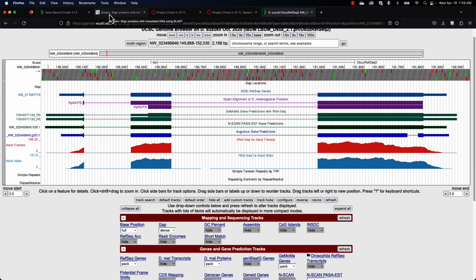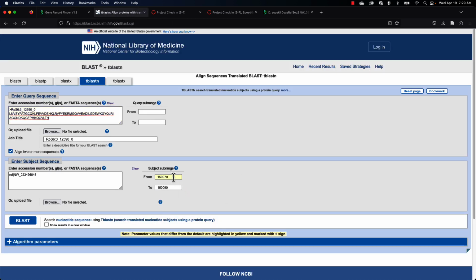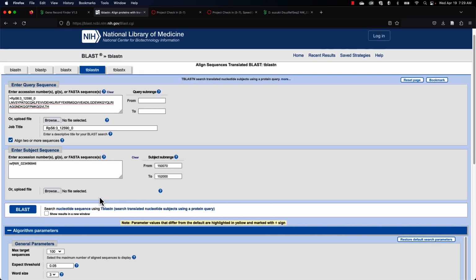And so let me go ahead. And the exon that I'm thinking I'm gonna get, because I'm in PB, I'm thinking I'm gonna grab this exon right here, but I'm just gonna put that range like I just said. So we'll do that. I guess I can just leave it like that and then just do 152,000. Okay, and then let's see what happens. Wait, let me make sure all my stuff is set. Okay.